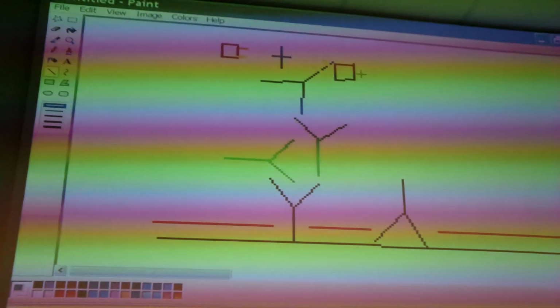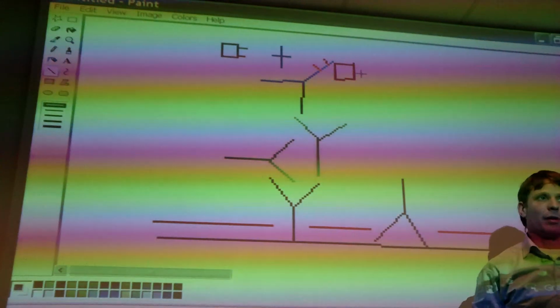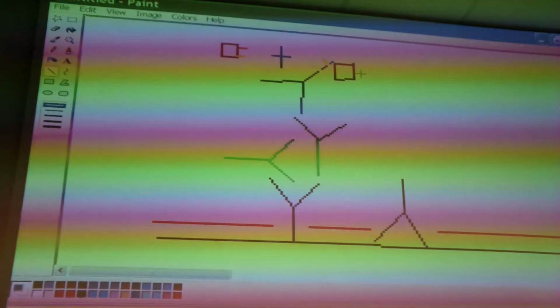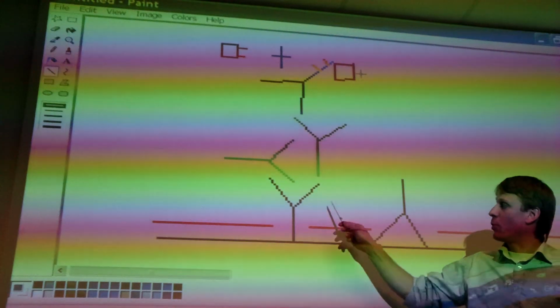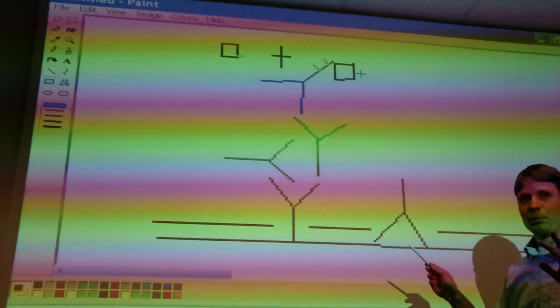Okay, but we had the important issue that we were afraid that the blue one is binding directly to the black one. So how can we reduce this possibility? There are a couple of ways. I'll give you a hint, otherwise you don't get me. From which source do you get this antibody? From mouse or goat.